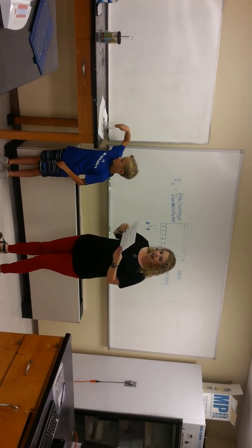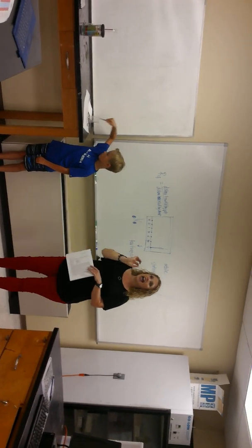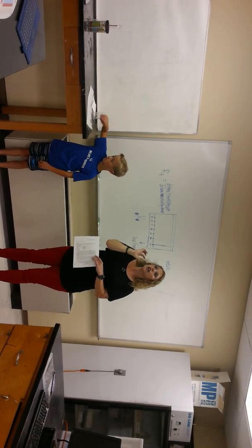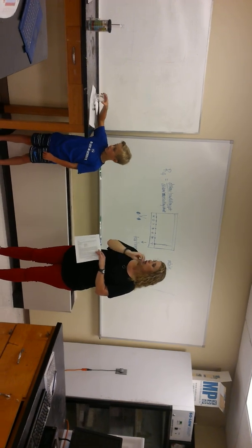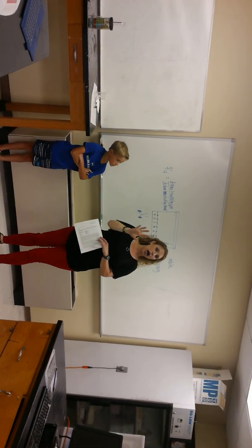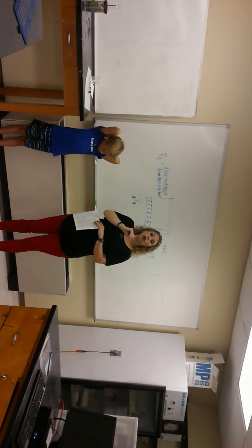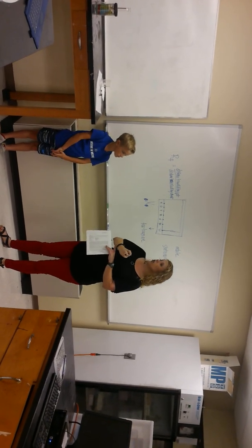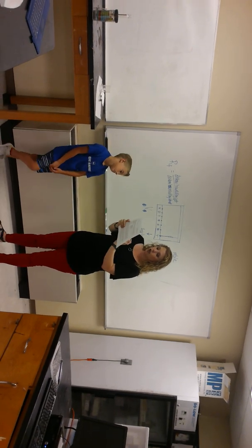Now to release that, and this is very, very important, you're only going to add enough ammonia to cover the yarn. You need to get a concentrated dye solution. Ms. Carmen and I did this lab lots and lots of times so that we could get this just right. And one thing that we found is if you add too much ammonia, it's not concentrated enough, and then you have to boil the solution and you can't see the color. So be sure that you don't add too much ammonia.